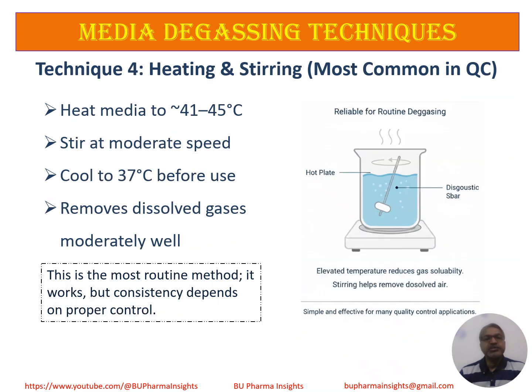This method is based on Henry's law. As temperature increases, gas solubility decreases. By heating the dissolution medium, dissolved gases are released more easily. However, temperature control is critical. Overheating can introduce variability and inconsistency.